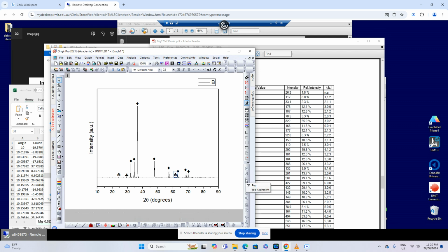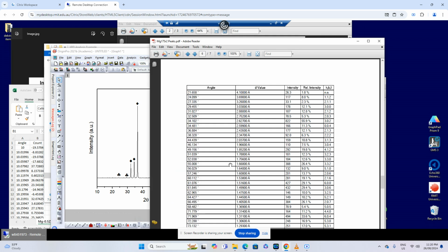Okay, so it means that this peak corresponds to the magnesium 17 strontium 2 compound. All right, and similarly we will do for this phase, this peak, this peak. Okay, let's do it. We have a peak at 72.64. Do we have 72.64 here?